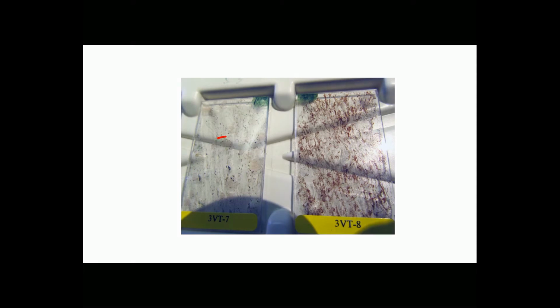Here's a slightly closer view of 2 of the sections we just saw. The rock on the right, the brown material, is biotite mica. The light-colored material is mostly quartz and feldspar. The rock on the left has much lesser amounts of brown biotite, but they're still a little bit present, and there are a few round obvious garnets.